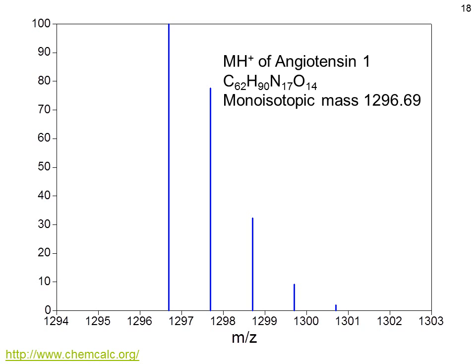If you want to play around a little bit with different compositions and how the isotope patterns look, here's a link to the ChemCalc algorithm, which allows you to do that.